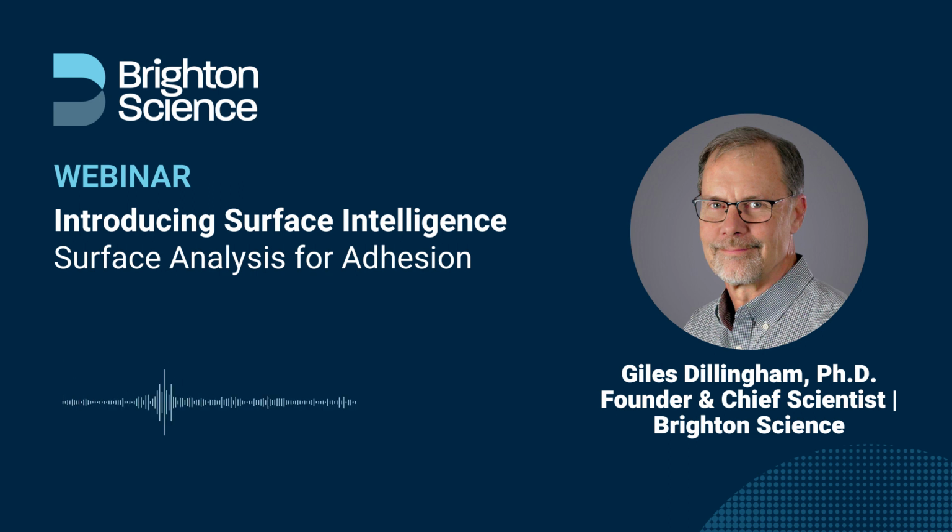It doesn't tell us what is on a surface, but it tells us if a surface has changed, right? It tells us if a surface is contaminated. It tells us if a surface hasn't been treated properly. It doesn't tell us why, but it's a great flag for indicating there's a problem with the surface. It makes it a really good process control tool for manufacturing.